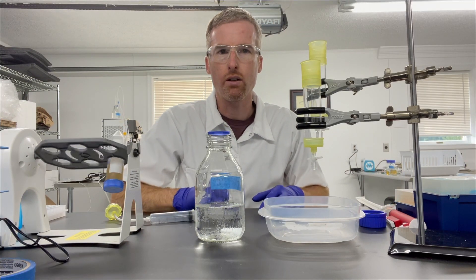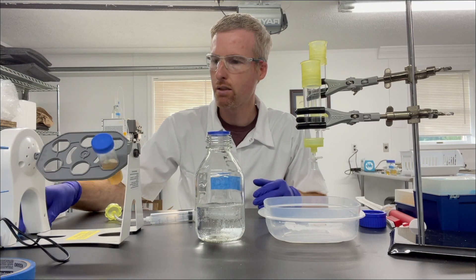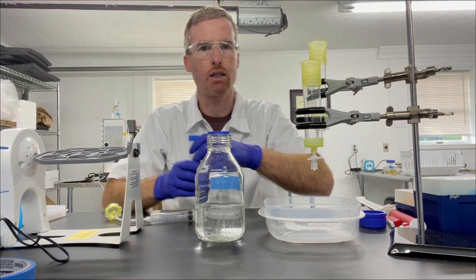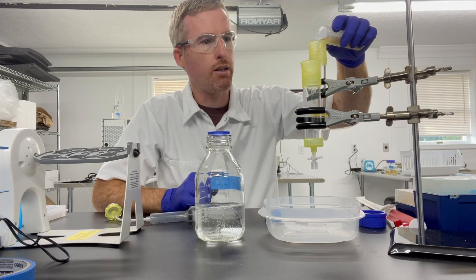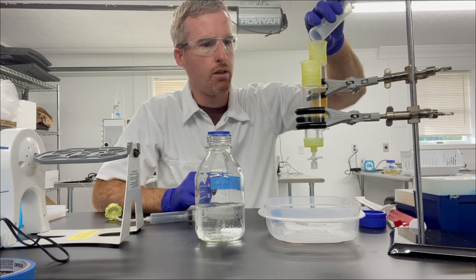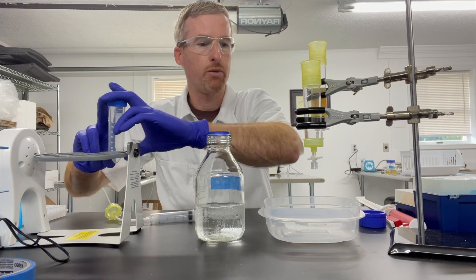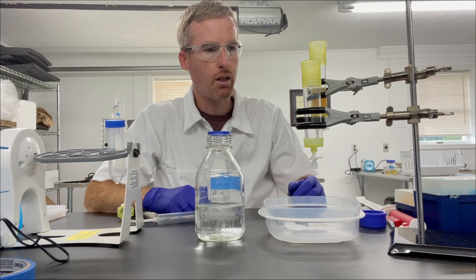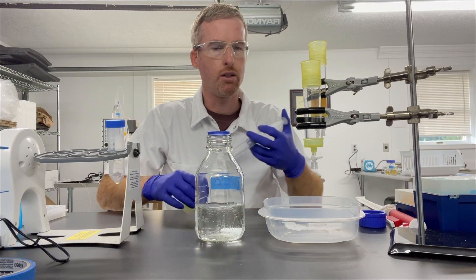Okay, so our lysate and nickel agarose have been mixing for about 15 minutes, and the his-tagged proteins should be bound to the nickel agarose at this point. So I'm going to take it out, and I'm going to pour it into a Bio-Rad Econo column. So this is a gravity column, but we're not going to be using gravity, which I'll show you in a minute. These are really great for purifying proteins, and I actually have two of them here. I'm going to purify two proteins in parallel.